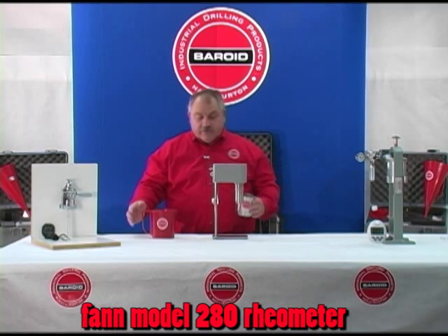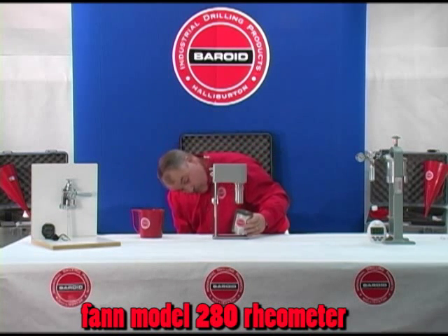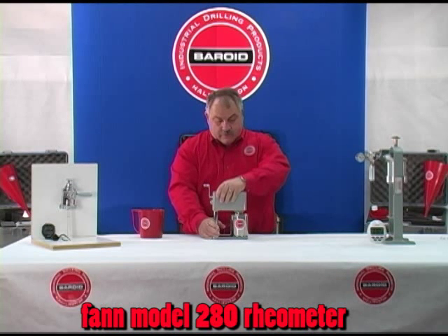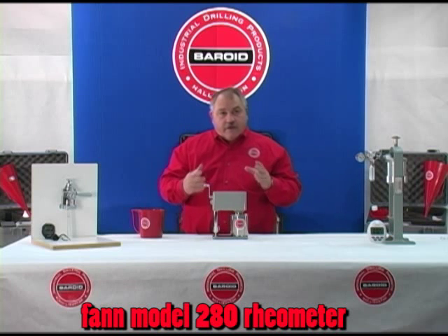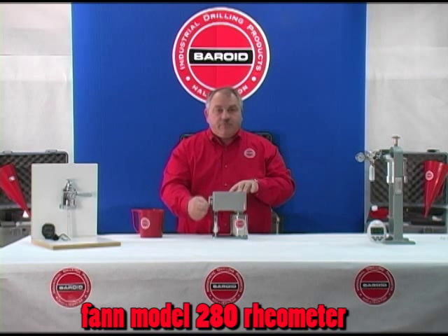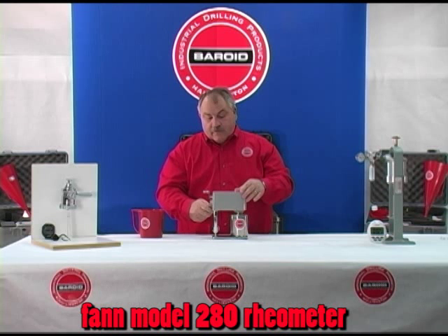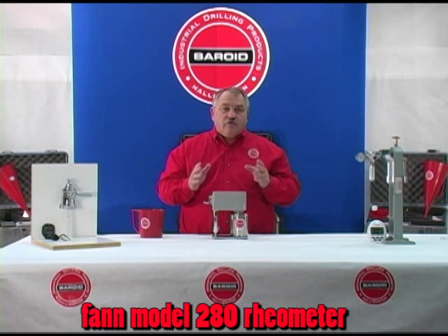When we add our drilling fluid to the cup and set it in place, we insert the top body to the scribe line on the cylinder. When we crank this, we first have a stirring speed, which allows us to break any gel strengths that may be built in the mud. We change that to 600 rpm and turn the crank. Then we also take the reading at 300 rpm. These two numbers give us the basis for plastic viscosity and the yield point of the drilling fluid.